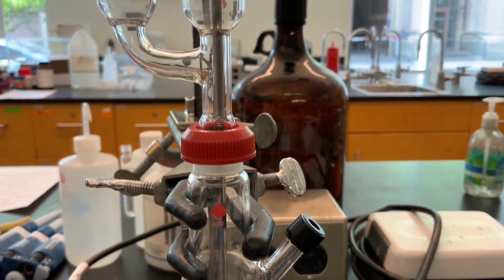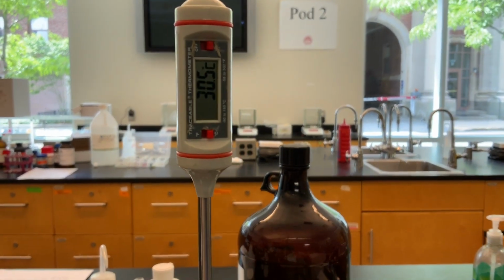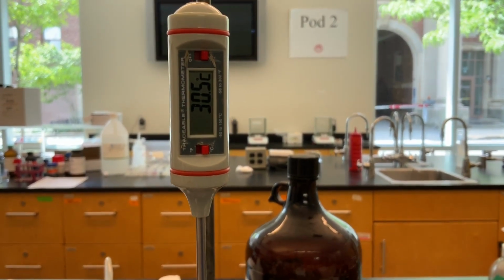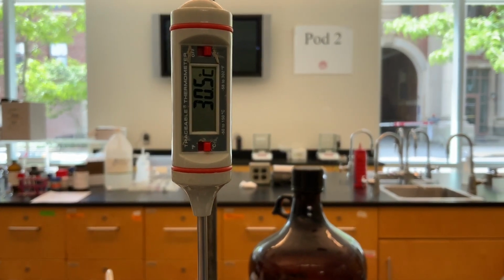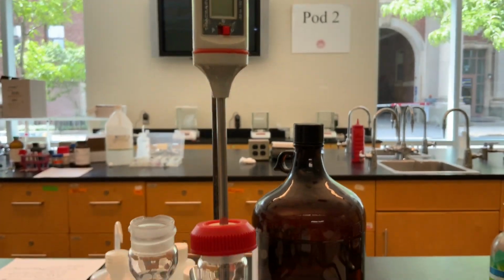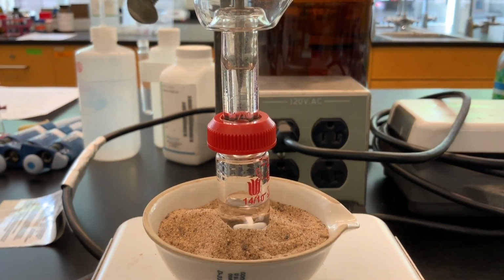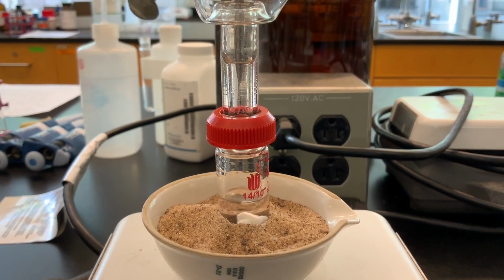Right now it just started boiling, so there are no vapors yet to hit the thermometer, but we can see that the air in there is hotter just because it's over this hot plate. It's 30.5 degrees now, but we're going to expect close to around 69 once the vapors of the hexane start to rise.